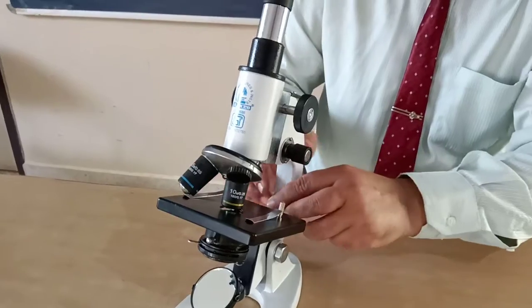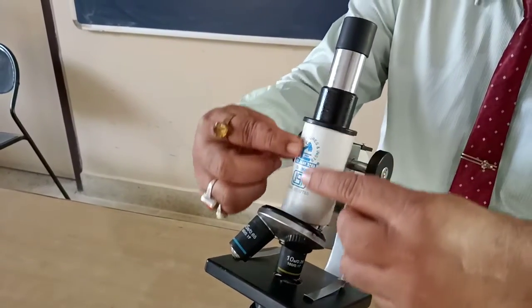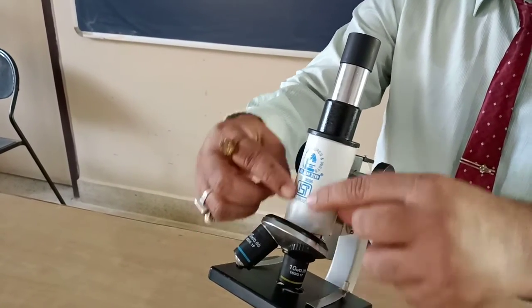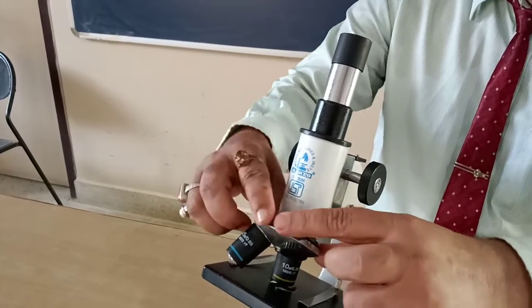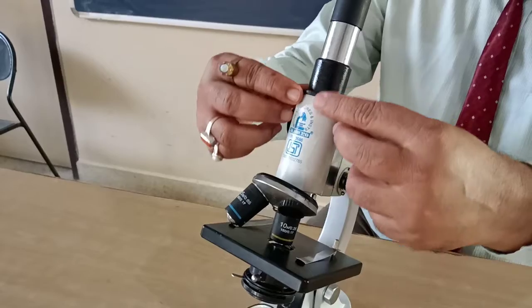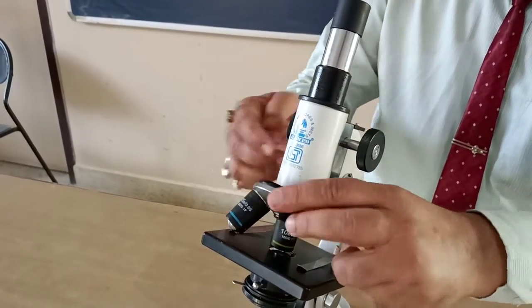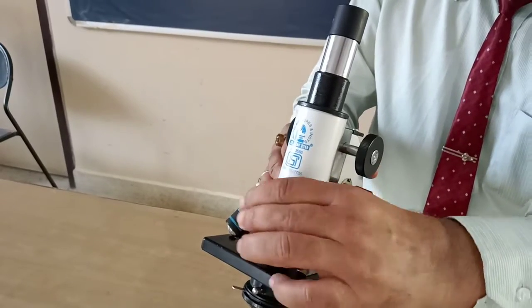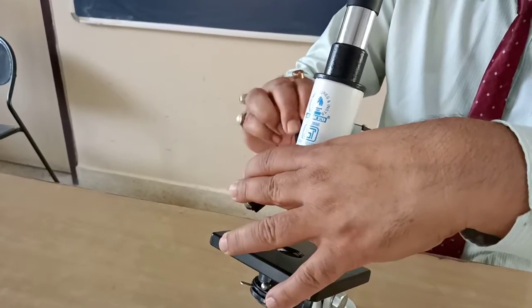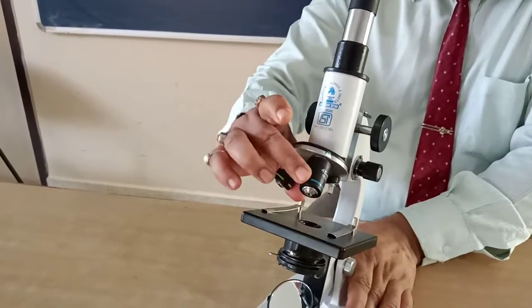Now the next part is body. This is the cylindrical body of the compound microscope. This is called body. Okay, now this body on its lower side has the nose piece. This is the nose piece. Nose piece is also movable. We can move the nose piece. It is movable like this. See this? It is movable like this.